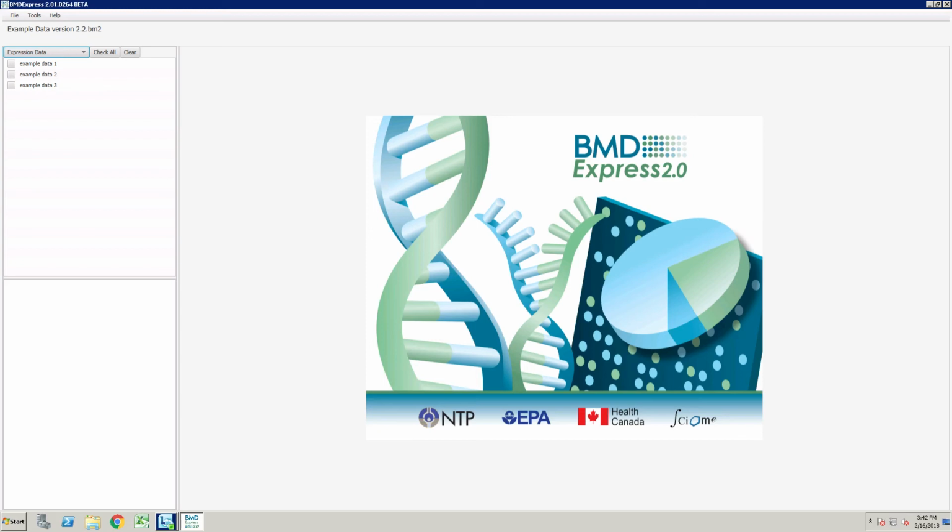So this is a workflow video for BMDExpress 2.2. It's a quick overview of how to work through the analysis pipeline. And there are a couple of steps involved in analyzing data in BMDExpress.